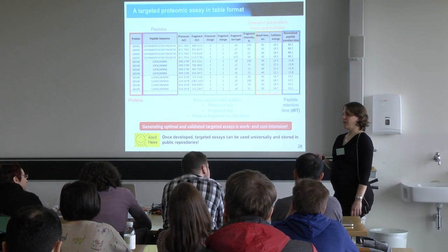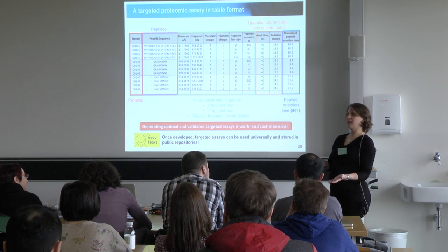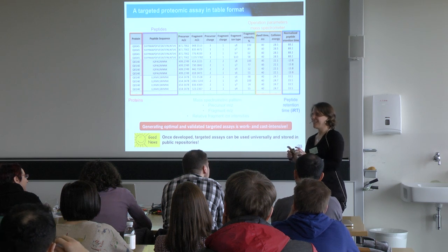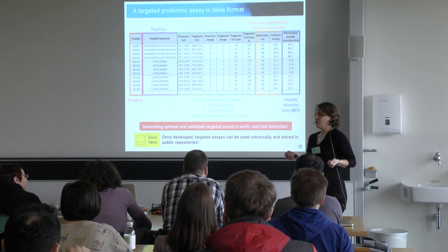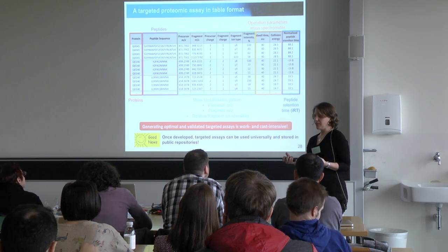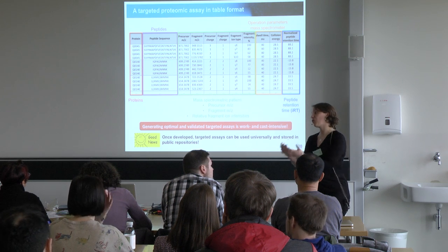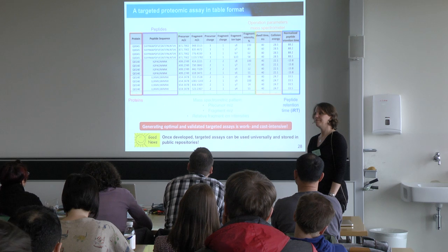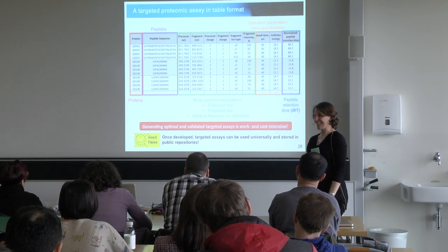Then what you use for quantification is again another question, and many people use several for identification and just the best for quantification, so you always must differentiate what people have really done. But even for quantification, I personally think it's always better to have several transitions. It gives you more data points, more robust data. But there are many publications out there that just use a single one.